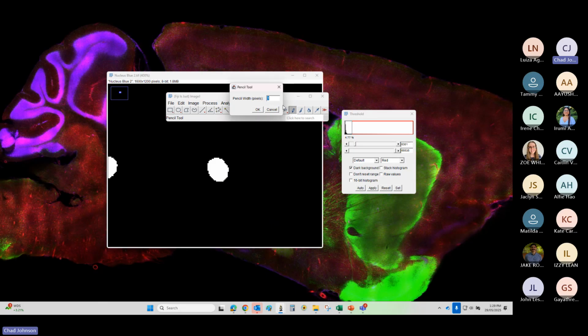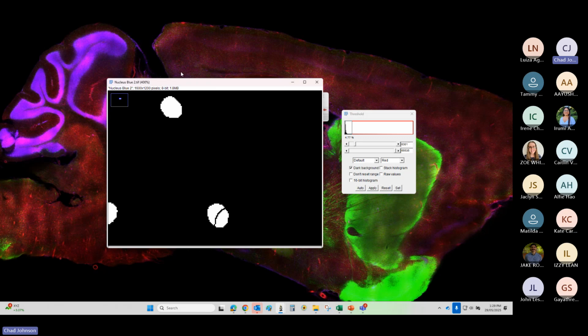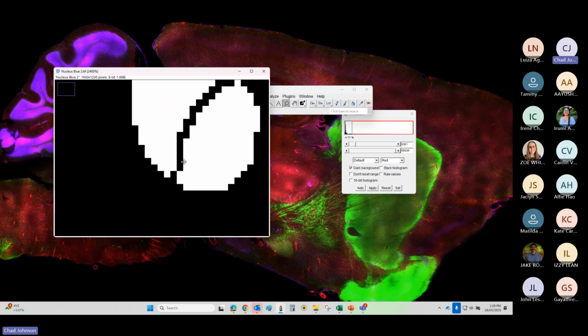1's a bit too small, you'll see when you draw, if I do that, even with a jagged line, you can see there that even though technically the line has gone through it, because it's only 1 pixel, it's still not segmented correctly.